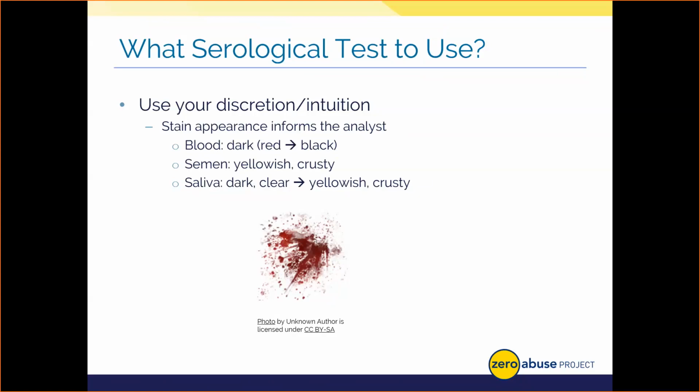If the analyst is ever in doubt on a stain, they'll consider going straight to DNA. If there isn't enough material present to work with, in short, the stain is too dilute or too small, or if serological testing is simply not a priority for that item. In contrast, the analyst may commence working with their investigative MDT and supervisor to unmask information to inform them as to how to best proceed if serological testing is absolutely necessary and the quantity and quality of the stain would allow for body fluid processing.